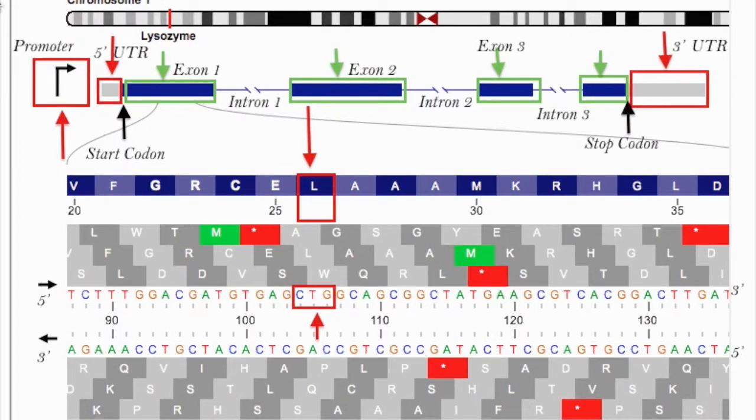So let's take a look at the sequence view. What do we have for the sequence view? This down here, as I said before, is the sequence view. From just looking at the sequence view, you can tell the RNA polymerase goes from left to right because you can see 5' to 3' right there, and 3' to 5' based on where you're looking. So from this, we can tell that the bottom strand is the transcribed strand, and the top strand is the coding strand.